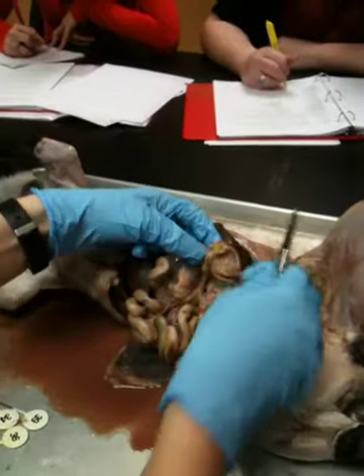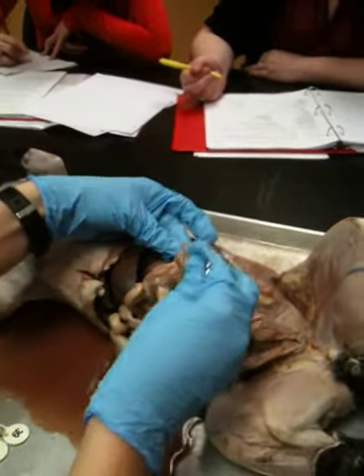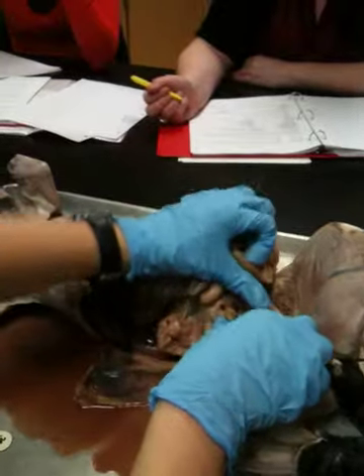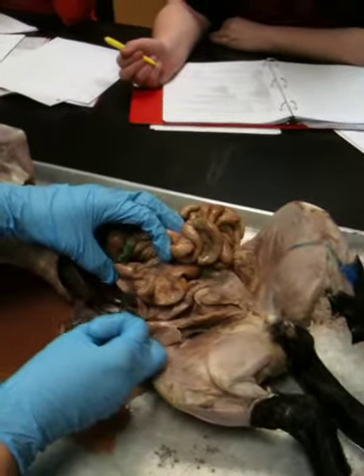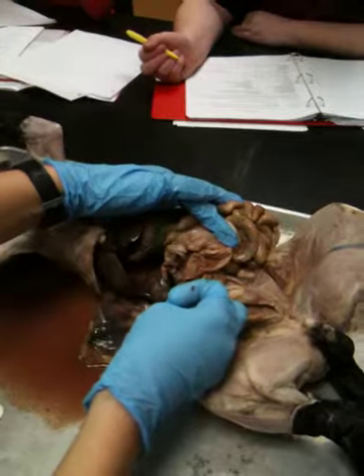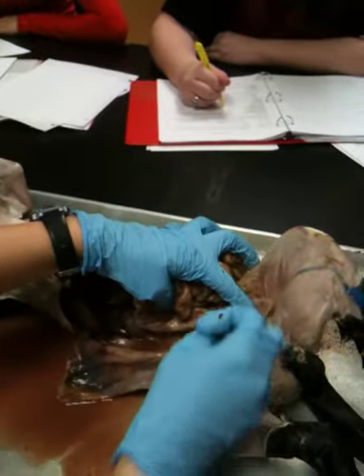So then there's going to be an area that's below the entry point. So the area below the entry point is called the cecum here. Okay, now it's all oriented weird because I got it pulled out. This is the orientation for the large intestine. So that would be cecum down there. And then it has ascending colon. And then you'll see it makes a turn. So that's transverse colon. And then it starts heading down. Descending colon. And then when you get down towards the bottom, this is called rectum.